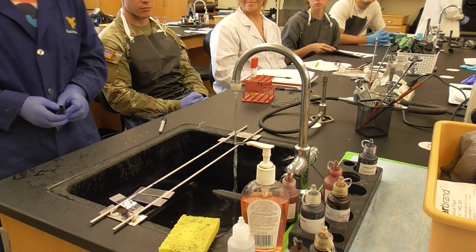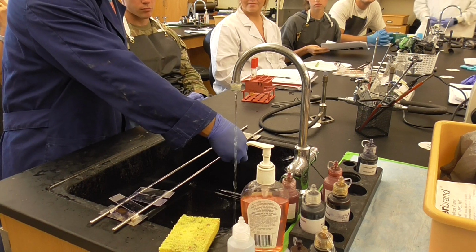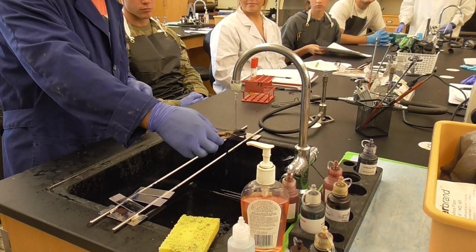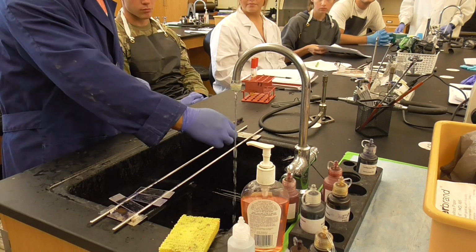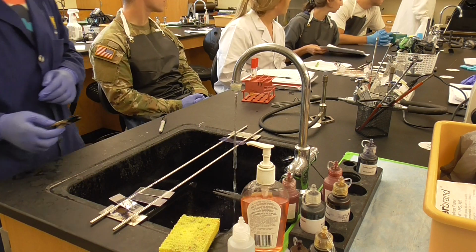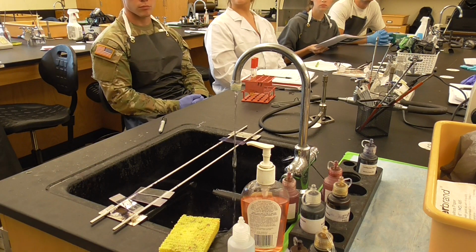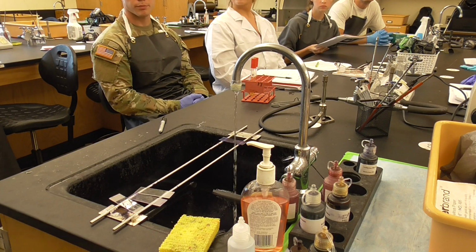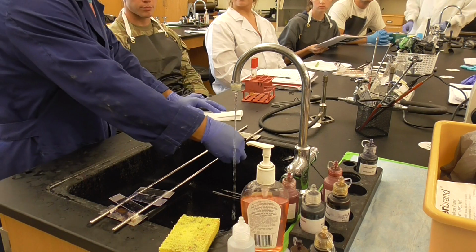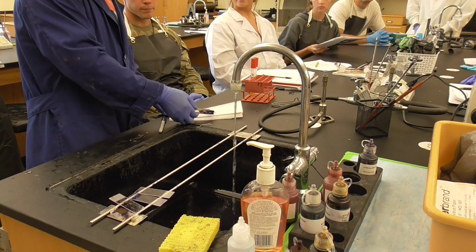Then you stain about a minute. Okay. Let's say 1 minute is ready, so you rinse it. Do you have a paper towel? These things you have to be ready. Okay, just give me a paper towel. Maybe 2, not enough one. Rinse it. You have a paper towel.